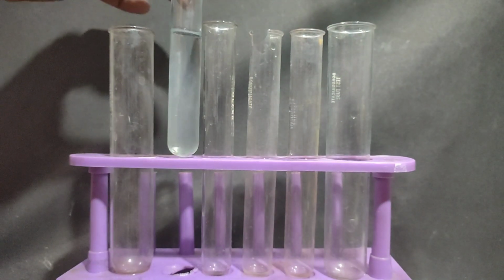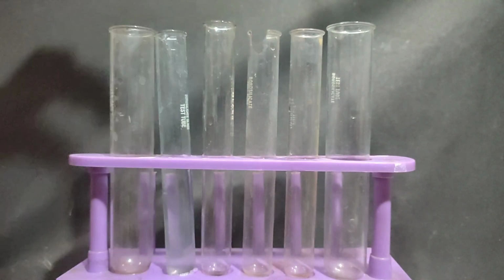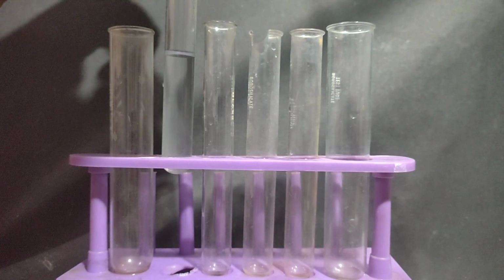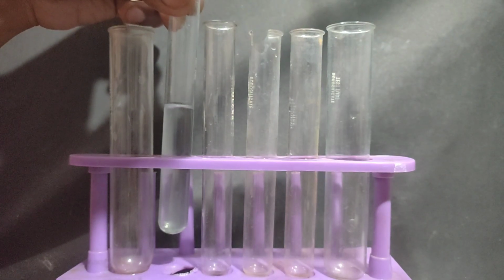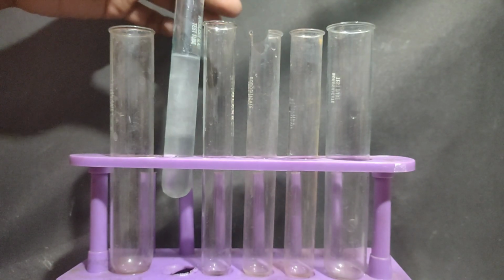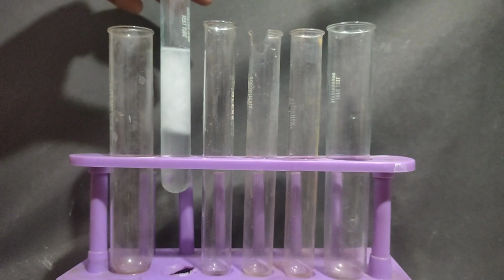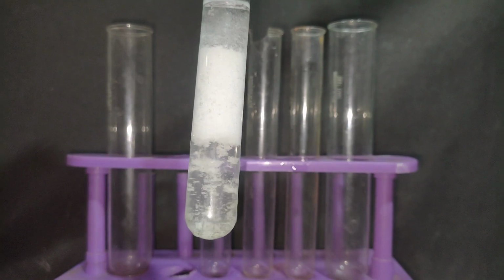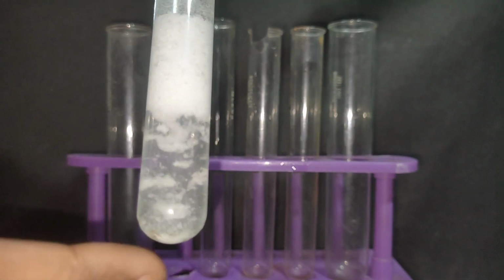When our original solution is prepared, I'll be adding dilute hydrochloric acid into it, which is the group reagent for group 1. Observe when I add dilute hydrochloric acid into it. On adding dilute hydrochloric acid, a white crystalline precipitate of lead chloride is formed. You can observe that the precipitate is crystalline.